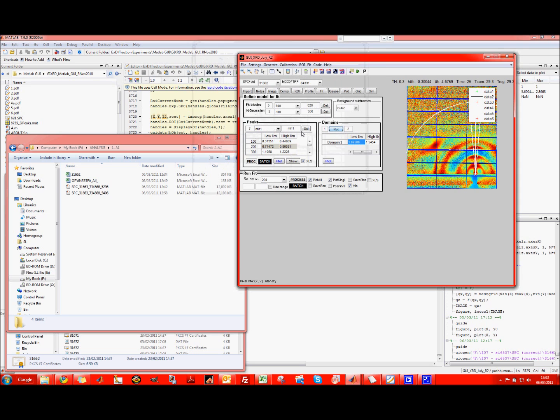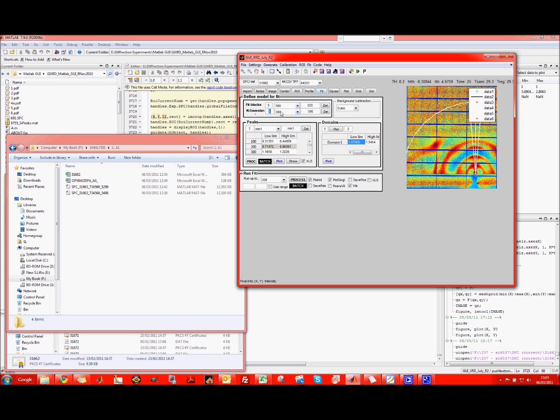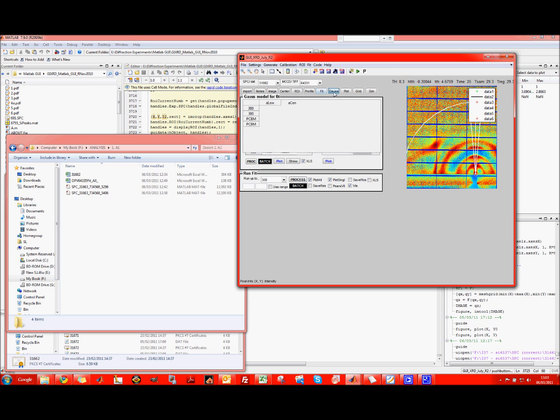Okay. So again, fit. I need the PCBM. Pick 3.